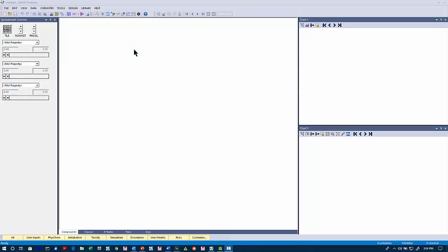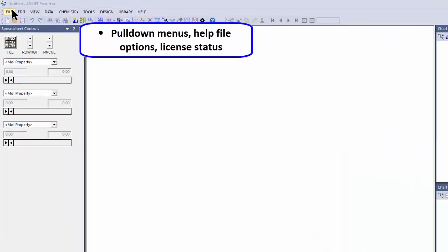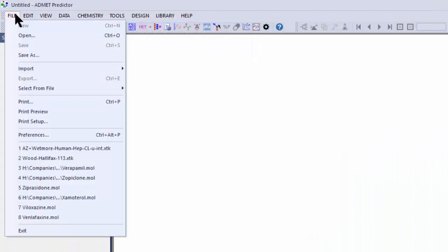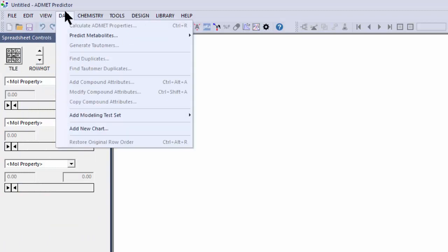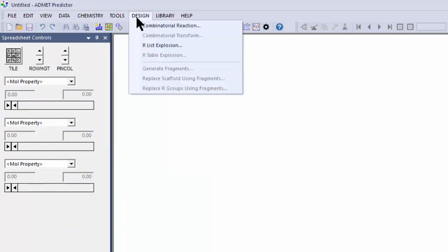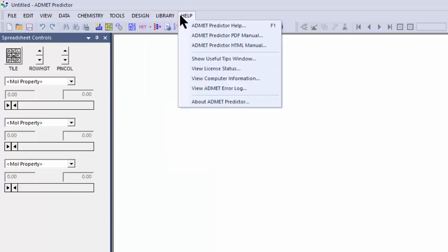So let's get started with Admet Predictor. I've opened up Admet Predictor version 9.5, and I'll start up here at the top. We have pull-down menus starting with File, Edit, View, Data, Chemistry, Tools, Design, Library, and then finally the Help menu.